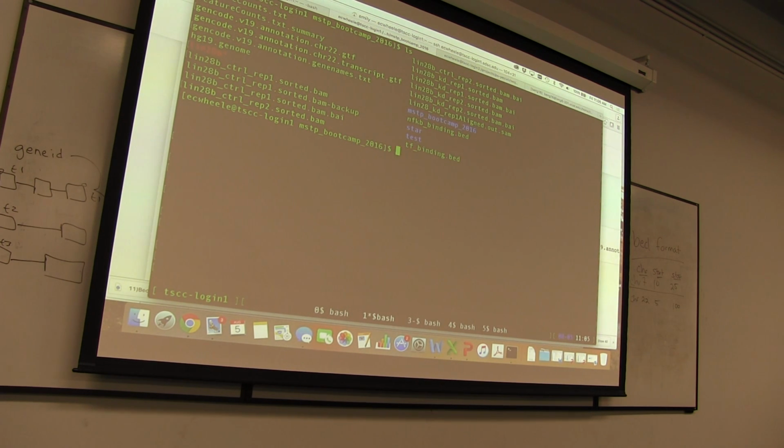So would the first and second have the same observable ones? They would. But maybe not all of them do. So maybe this one looks like this one here. This is T4. So yes, a lot of them will be the same start and end points, but have different stuff in between. But then within each transcript, all of the exons are defined individually. Right, so this transcript is going to have 3 exon lines. This transcript is going to have 2 exon lines. And in this case, this exon line will be the exact same, and it will be repeated for this transcript because it's the same one.